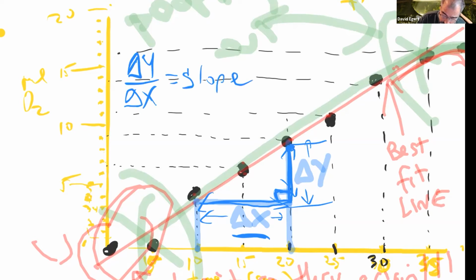So this is going to be whatever value the Y is here. So I have to find out, and I look at the line. I don't care about the dot. The line might be on the dot or it might not be on the dot. Don't use the dot or your data as the value. Use the line. And I say, okay, let me come across. And that's around 6, 7, 8, 8.5.